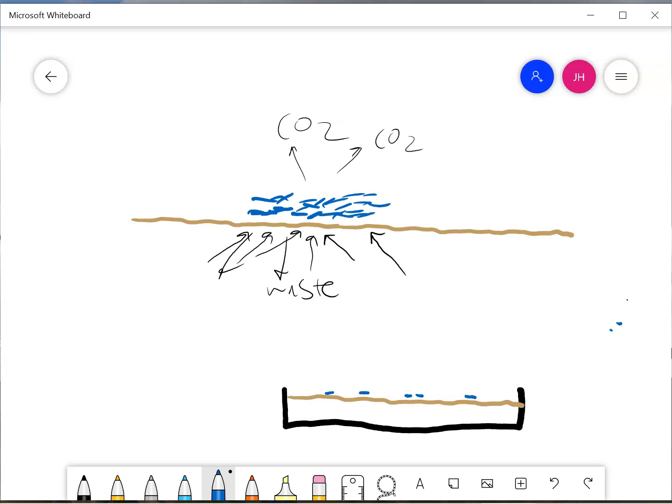And they just grow on the surface of the agar because the cells get nutrients which can diffuse through the water to them. It's a really brilliant thing that cells need water, right? Well, that's not the brilliant thing, but the realistic thing is that every growing cell is in water or needs water. And this is a way we can give bacteria water without suspending them in water. So they stay in one place. So they make these colonies.